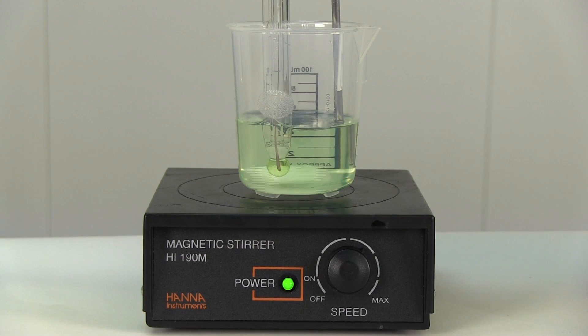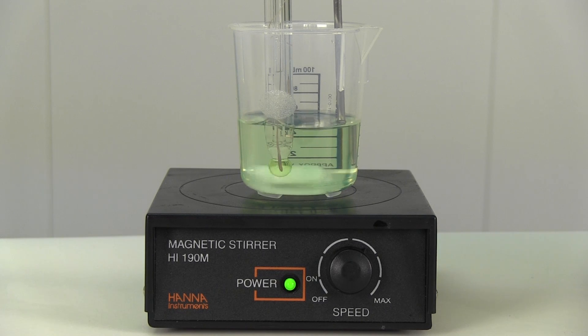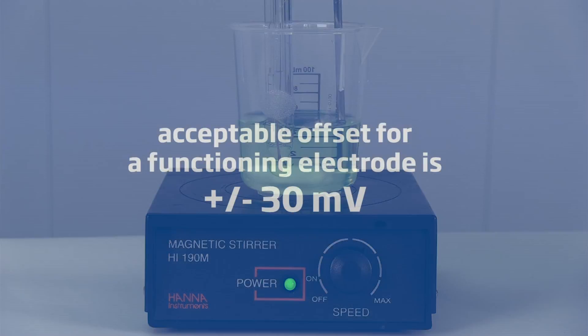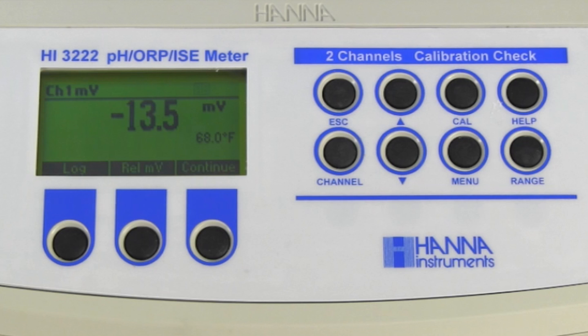To determine the offset, check the millivolt reading of the pH electrode in a pH 7 buffer. An acceptable offset for a functioning electrode is plus or minus 30 millivolt. We see that our HI1131B has an offset of negative 13.5 millivolt.